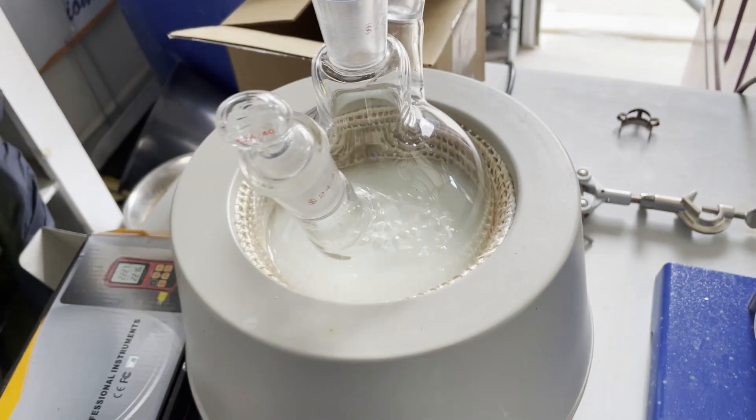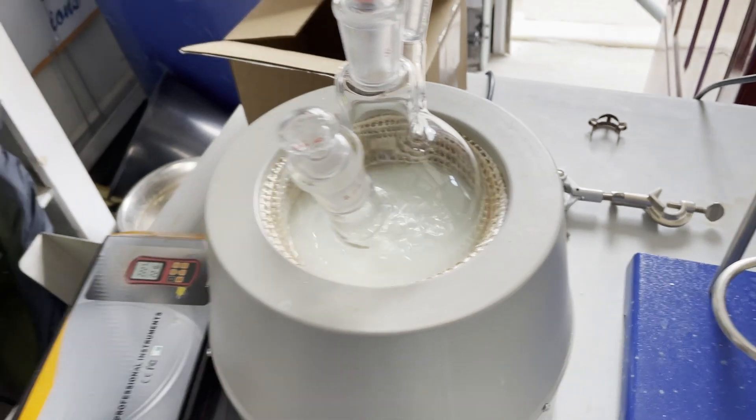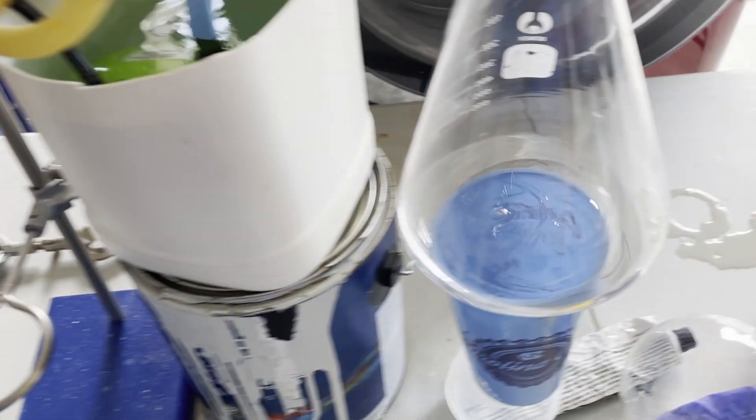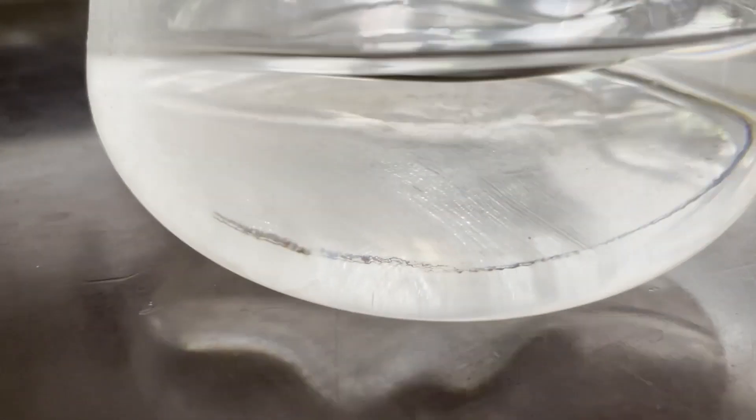That entire time, I distilled the ethanol a total of six times, attempting to solve problems that I could have just fixed in one distillation, which was very annoying — but oh well, now I have pure ethanol.